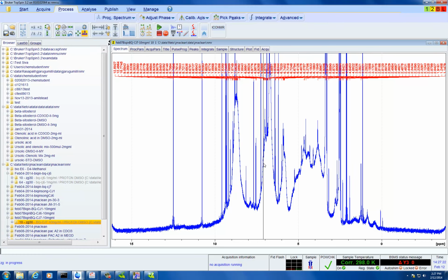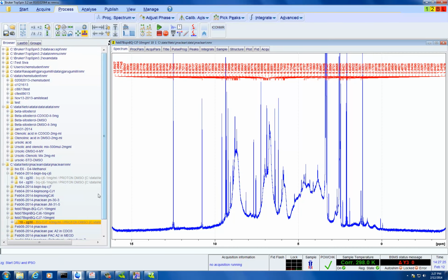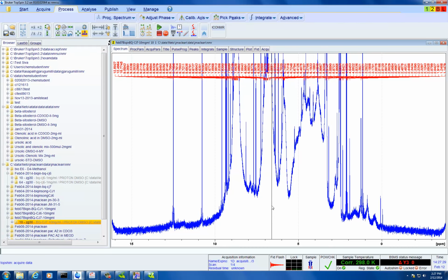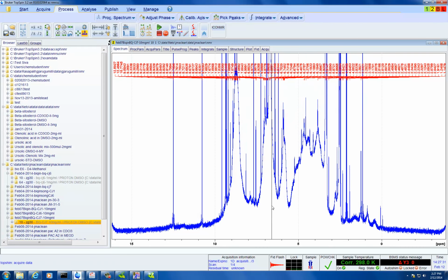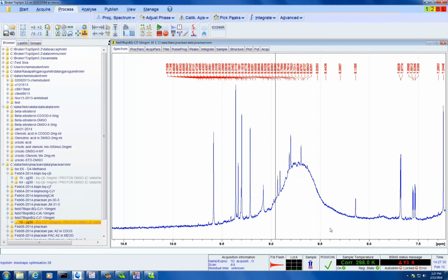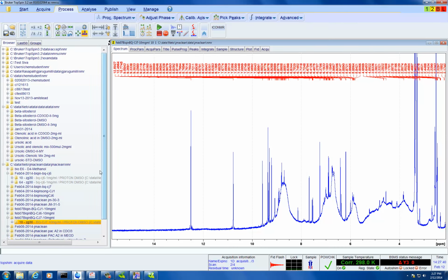But most of our samples look like that. We do not have pure ones. So, does this compound also have ursolic acid and all that? I don't think so. It's PEGs. So it doesn't have any oleanolic acid? No. It may have epicatechin.